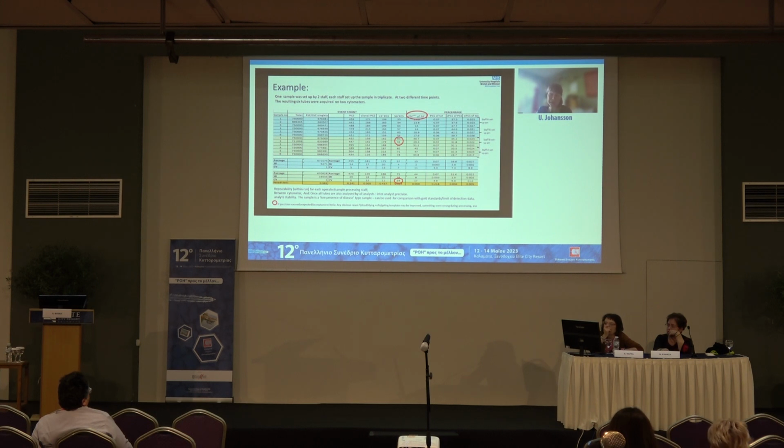So here was the total plasma cell percentage of the sample, and how many of those were clonal. And so that's that result, and that's the clonal plasma cell percent of all viable cells in the sample. And then we take the average, the standard deviation, and we can see the CV.